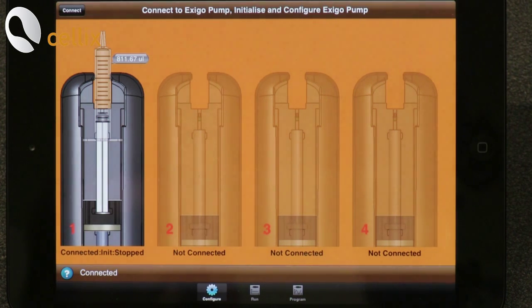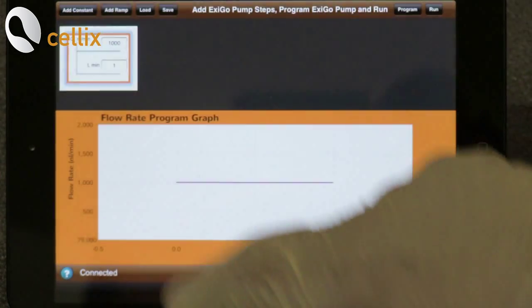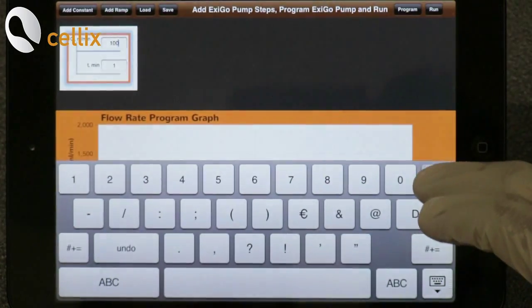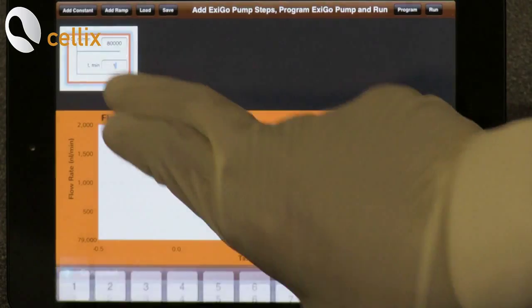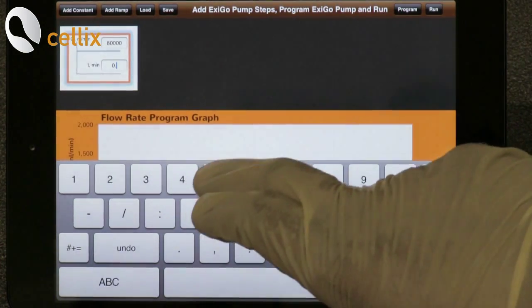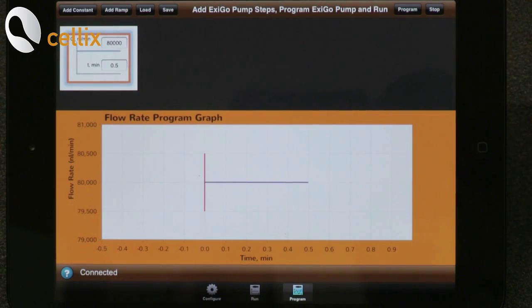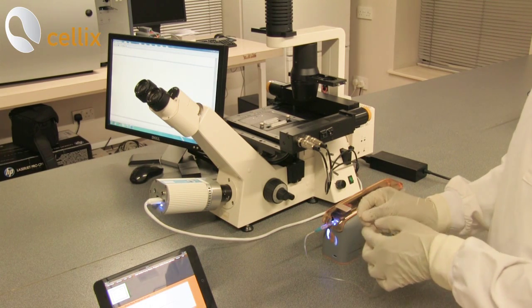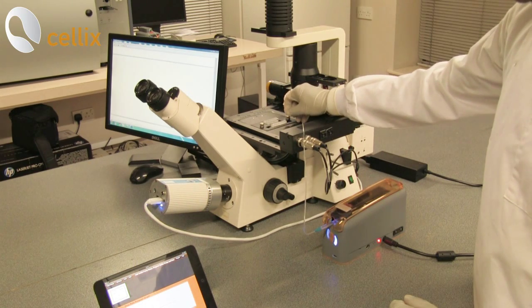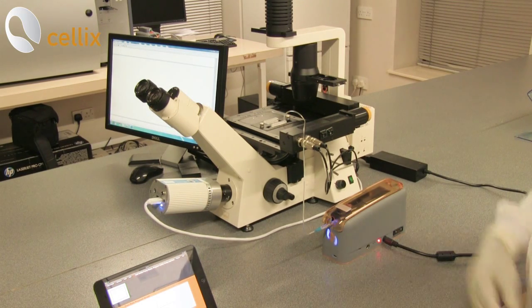Next we are going to connect the tubing to the chip to wash the channels. For that we need to program the flow rate. In the application, click program, click add constant, and in the small window change the value to 80,000 nanoliter per minute. Click done, and for time click 0.5 minutes. Click done, then click program, then click run. Now you can see the pump is running and a droplet is forming at the end of the tube. Gently insert the pin into the chip — now it is washing the channel.